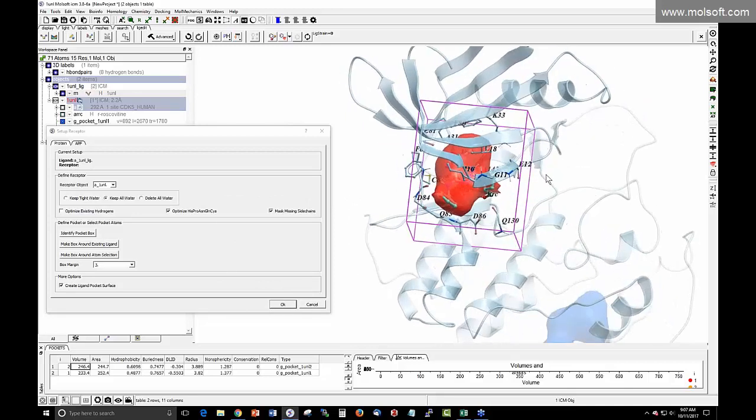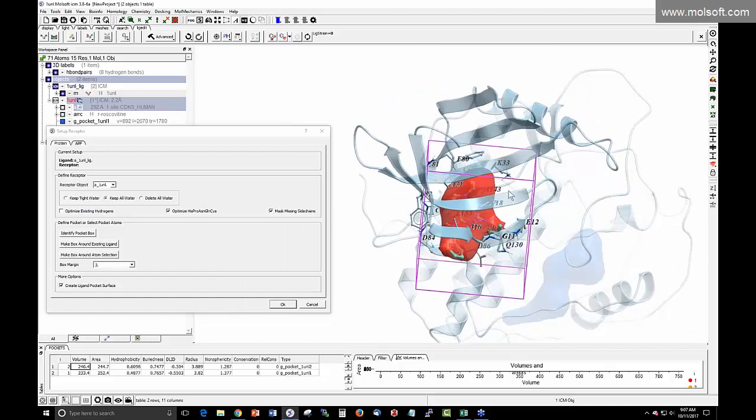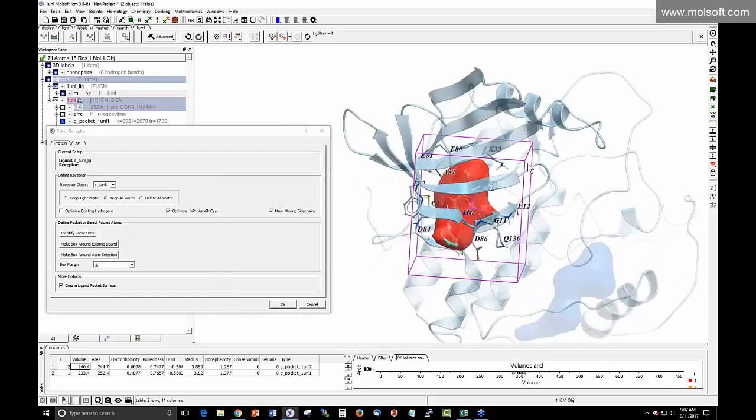In this example, we're looking down on top of the N-terminal region, and this box has not actually taken into account the tip of this glycine-rich loop. So you may want to increase it a little bit, and you drag it using the corners with your cursor, just drag like that. Okay. And now ICM will make the maps.